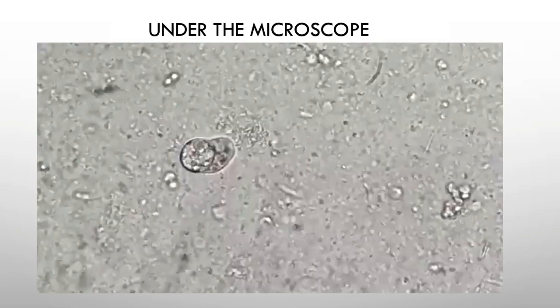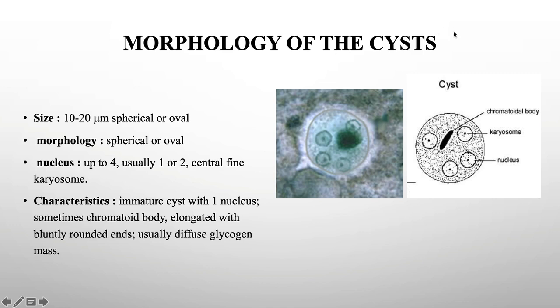Okay. So come here to the morphology of the cyst. For the morphology of the cyst, the cyst is going to consist of how many nuclei? 4 nuclei. Okay, and then it will consist of the chromatoidal body, and here you can see the karyosomes. Okay, the characteristics here. The immature cyst, I'm not going to mention this, and this is not important. The immature cyst is going to consist of only 1 nucleus, but the mature one 4.